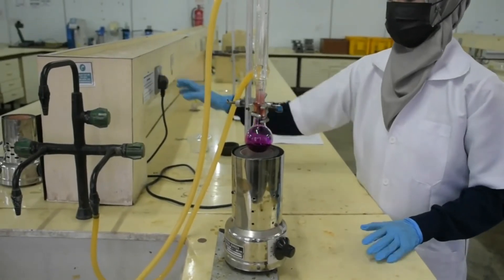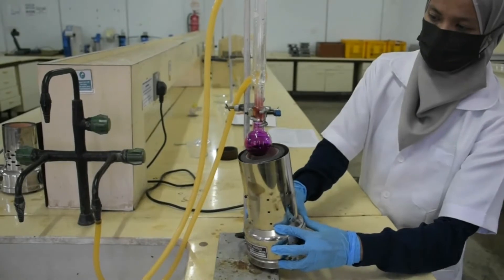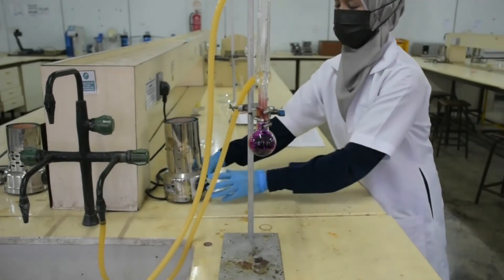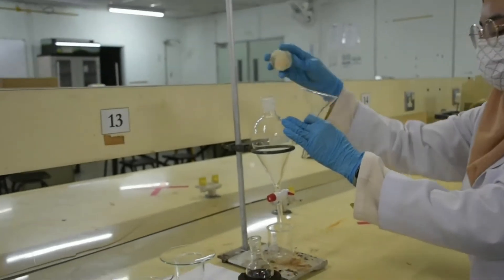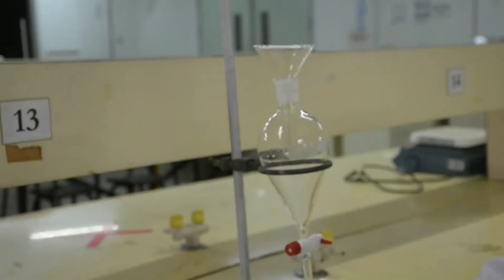After 10 minutes, allow the reaction mixture to cool down at room temperature. Pour the reaction mixture into a separatory funnel using a filter funnel.